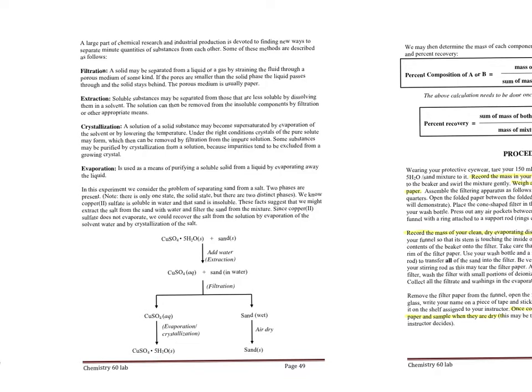The other side of this solution map, we have our sand that is wet in the filter paper. We're going to dry it. In the video, we actually use an oven, and we end up with the dry sand in the filter paper.